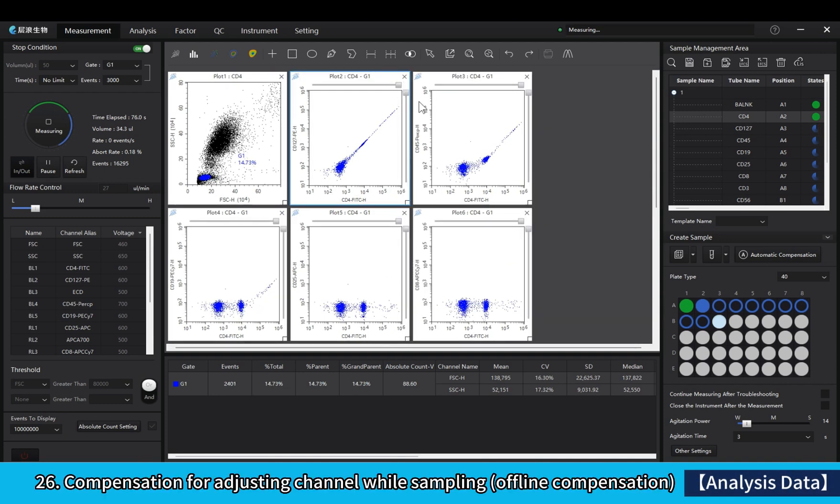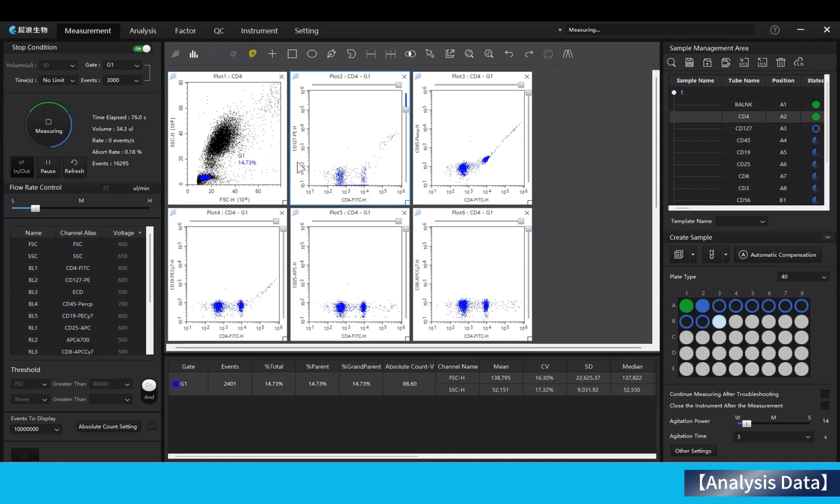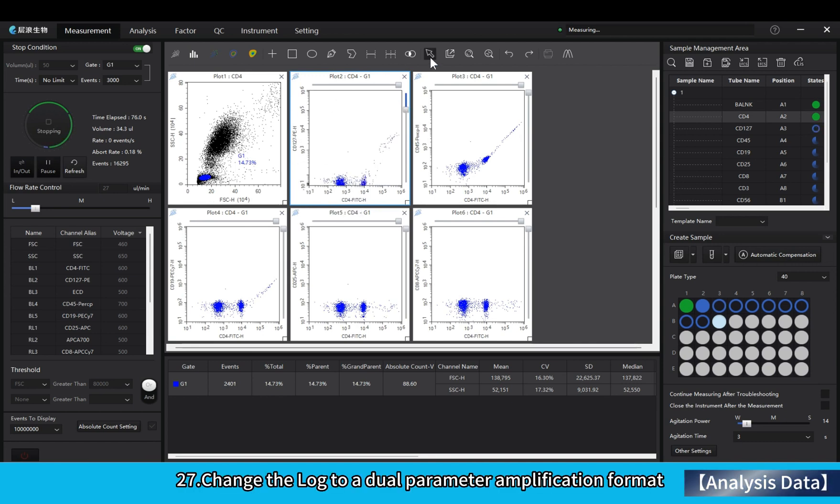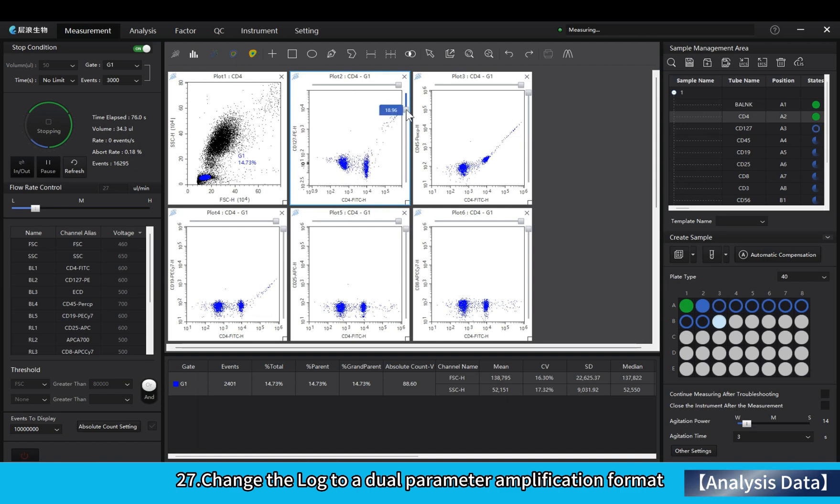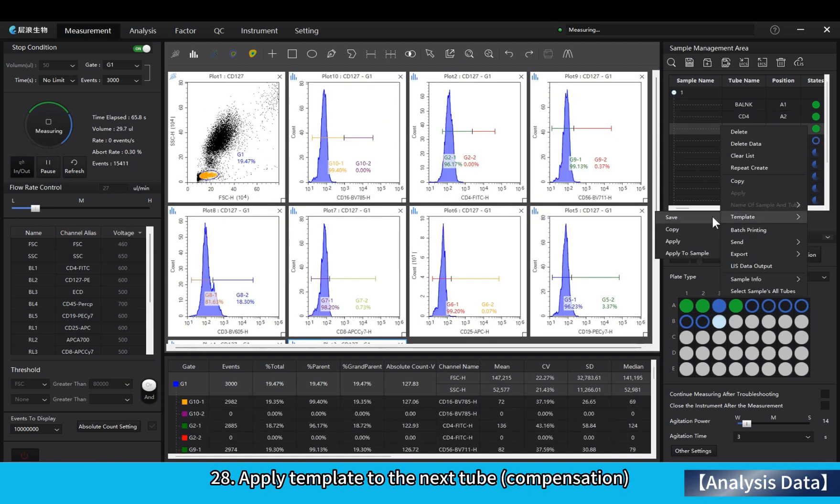Compensation for adjusting channel while sampling offline compensation. Change the log to a dual parameter amplification format.